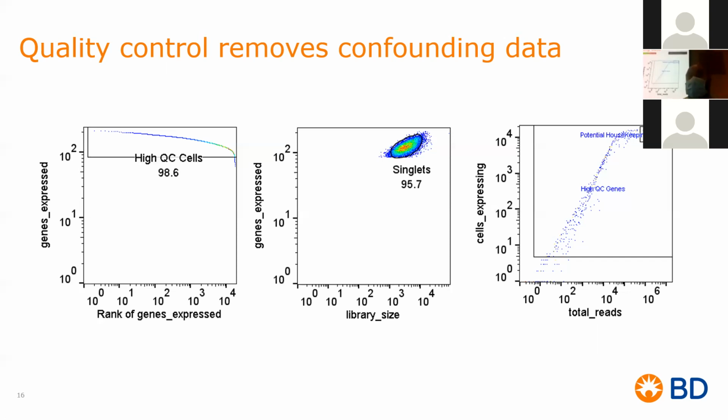So what does that mean? You may not have the best dimensionality reduction map you would otherwise have, if you did these steps manually and then ran it through Seurat. So again, this is kind of being done ad hoc because this is relatively new data, even though it was designated as the technology of the year.